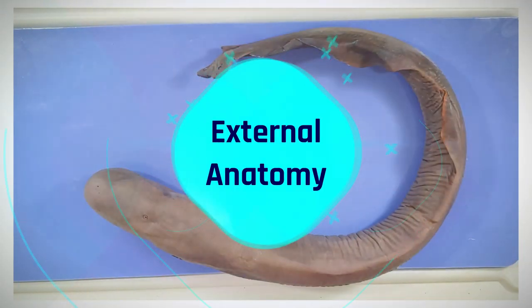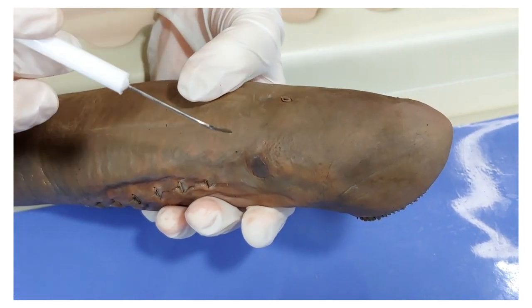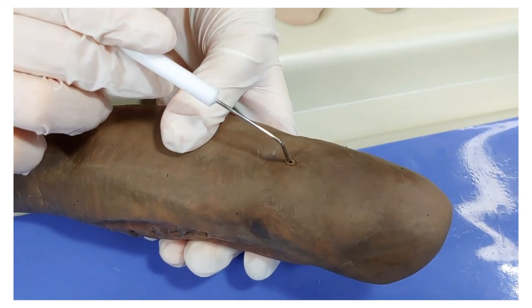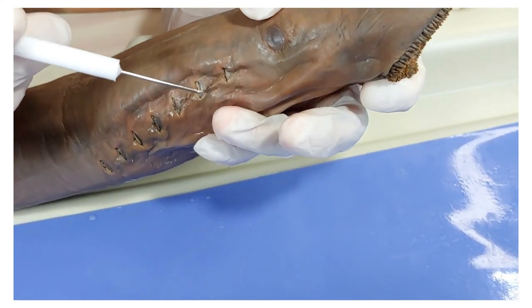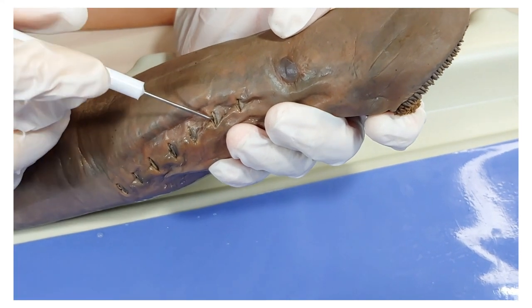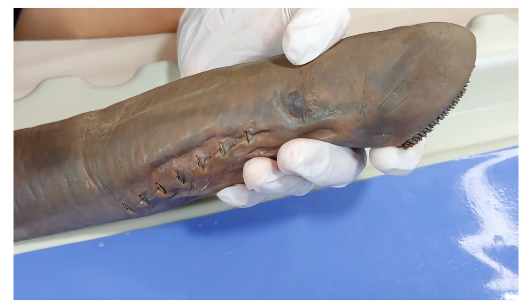The lamprey has some external structures to point out. Here are the two eyes, one here and one on the other side. Although they look opaque, that's because of the preservative — these eyes would be clear in a living organism. Between the two eyes is a small hole, which is the external nostril. On the side you can see seven small holes, and seven on the other side — these are the external gill slits, which lead into the gills inside. Folklore sometimes refers to lampreys as eight-eyed eels because some people mistook these holes for eyes and thought that lampreys had eight eyes on each side.